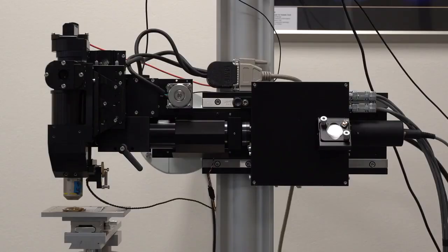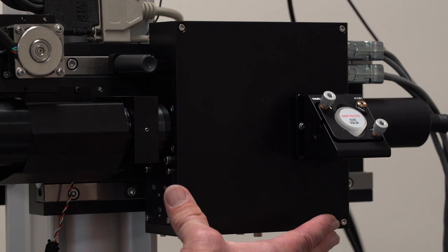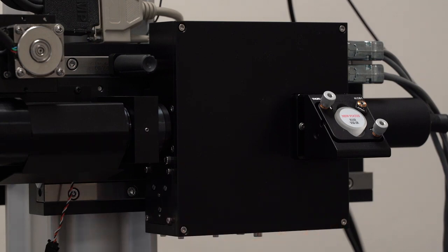The MOM we've been looking at on the table in front of us has a Sutter designed resonant Galvo-Galvo scan box. Several years ago, it was realized that one way to add additional scanning functionality to a scanning scope with a Galvo-Galvo scan path was to add a resonant scanner that was relayed into the Galvo scanners. Such a scan path called RGG for resonant Galvo-Galvo has several attributes. First, it can be used either as a resonant Galvo scanner or as a Galvo-Galvo scanner by simply keeping either one of the Galvos or the resonant scanner fixed during scanning. Such an RGG system allows for fast RG scanning for monitoring calcium activity or slow Galvo-Galvo scanning for structural imaging in a single scope with a single laser path.